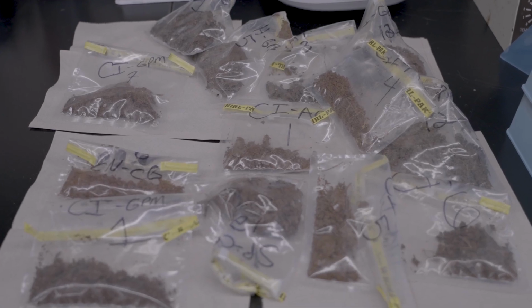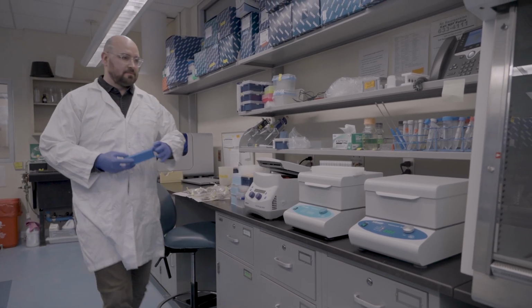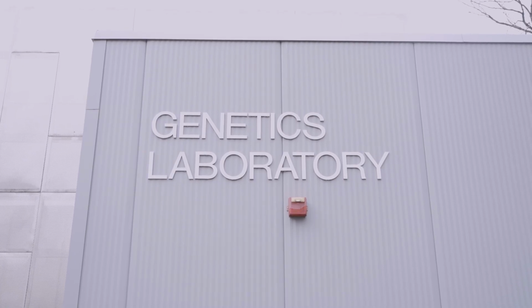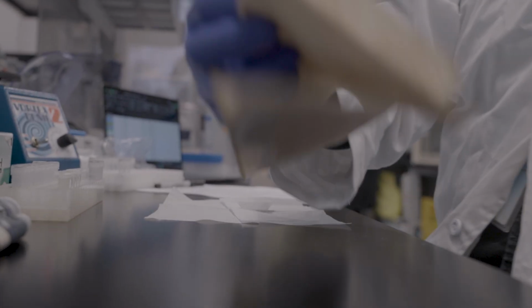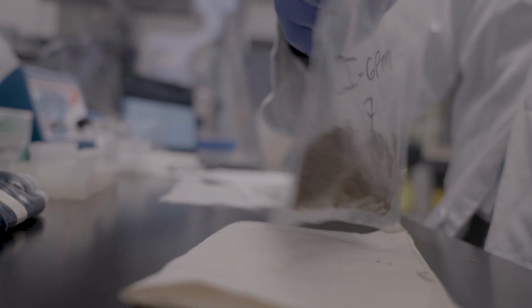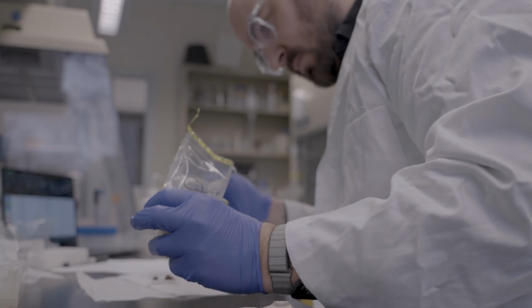The lab side is where it all becomes almost very mysterious, because we're working with things that are invisible. We're trying to get DNA out of bacteria, and to the naked eye, we can't see any of that. So it's always kind of fun to take something like feces or soil, something very tangible that we can see, and it's sometimes smelly and gross, and take it through a process that basically turns it from that to DNA floating in water.